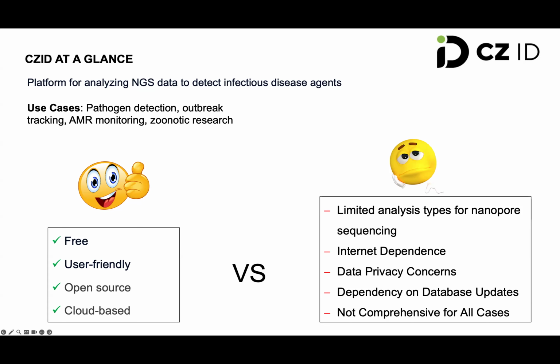The uploaded data is encrypted, but the access controls ensure that only authorized users can view or analyze your data. I will show you in a minute when we do the analyzing on that platform how it looks exactly, but you can choose between public analyzing and private ones, and I would recommend to always use a private one if you don't want to share it with the whole Mark Zuckerberg community.